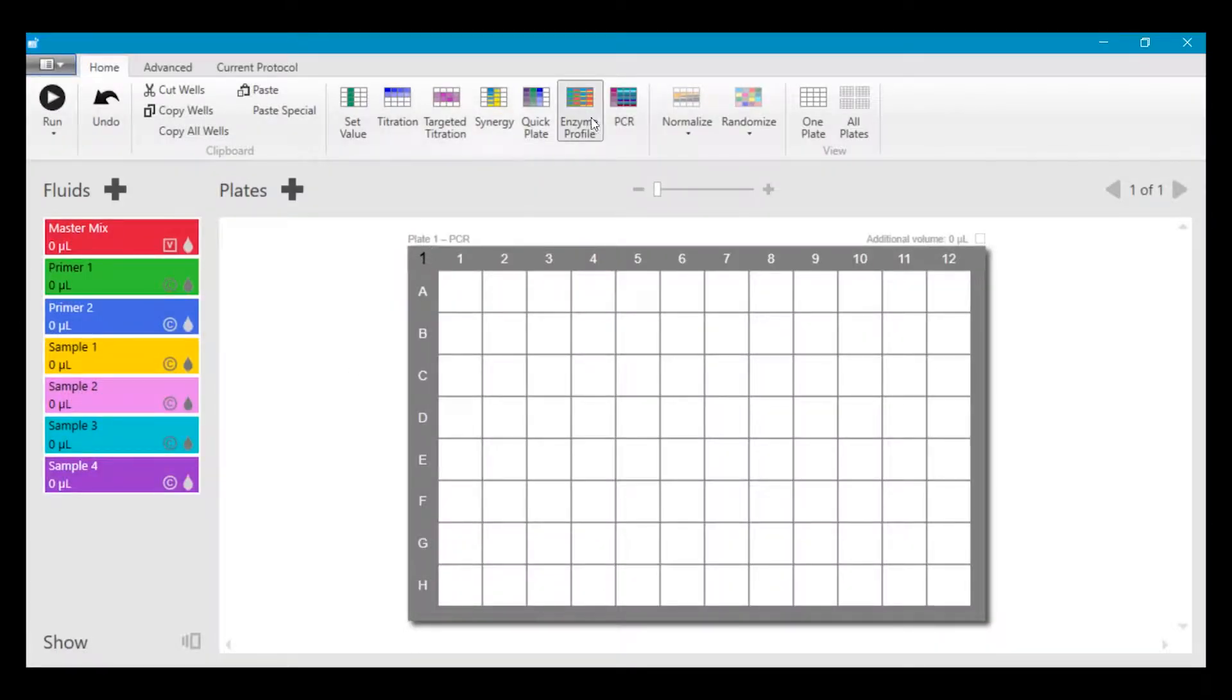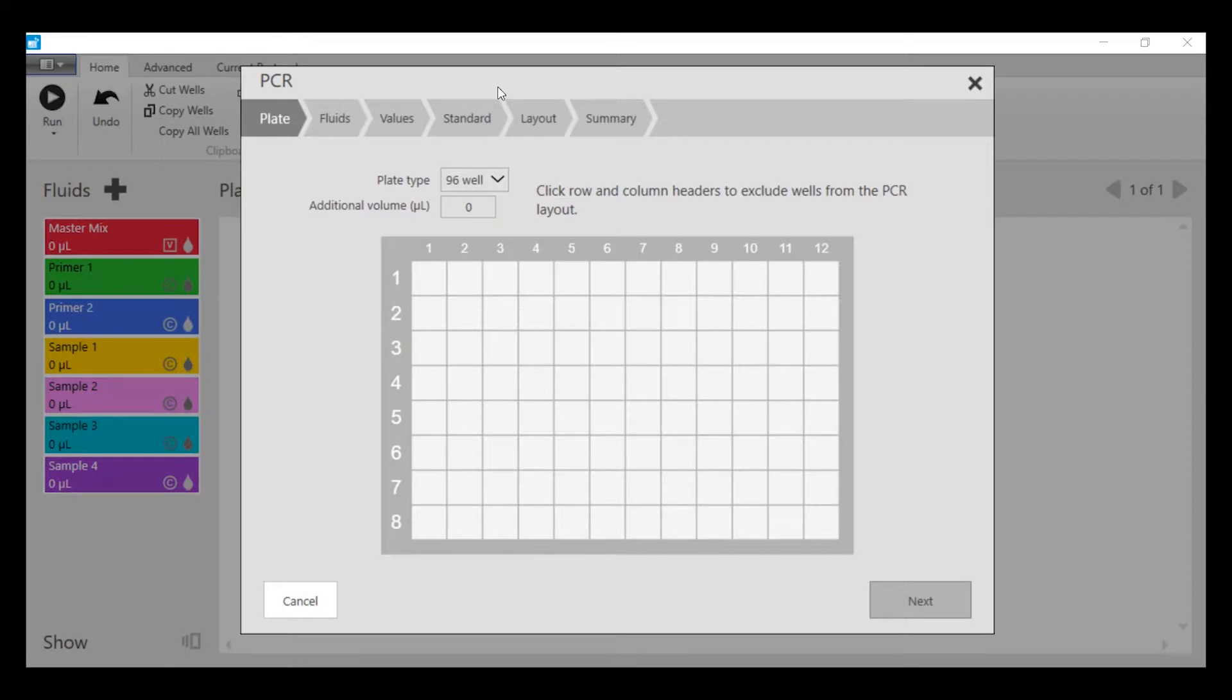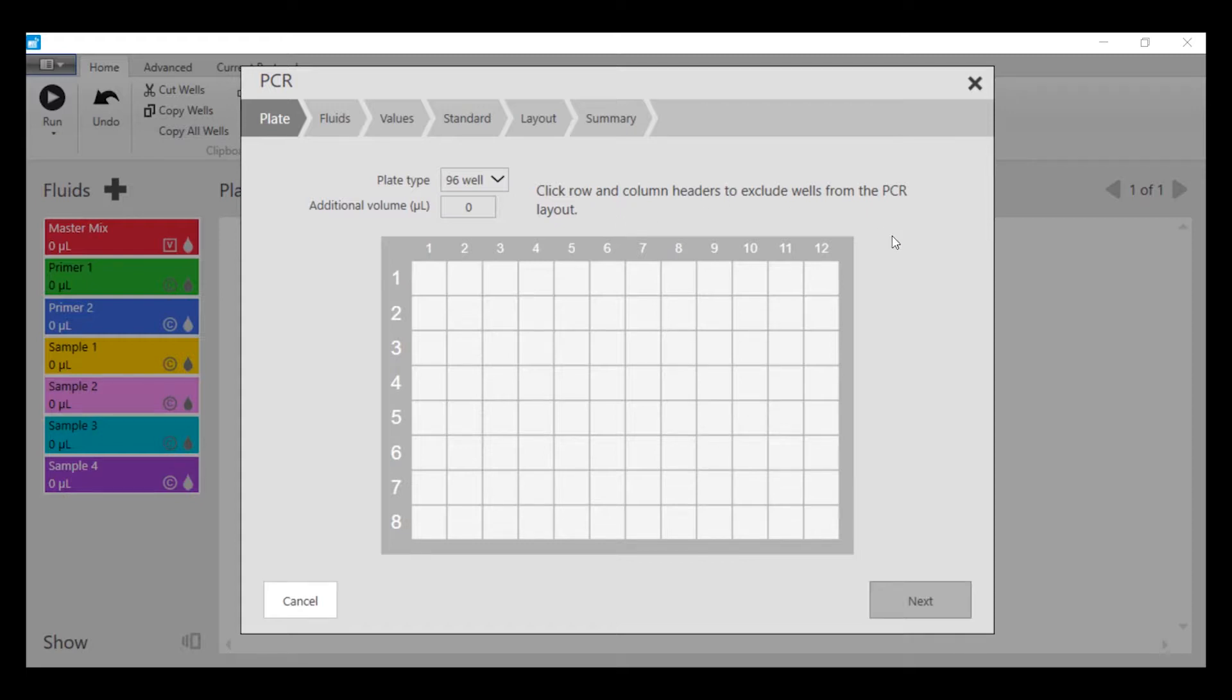Now we can click on PCR wizard and the first thing to point out here is that the additional volume is set to zero automatically. That's because all of the assay components are going to be dispensed by the digital dispenser as opposed to a standard assay where you have pre-added reagents.